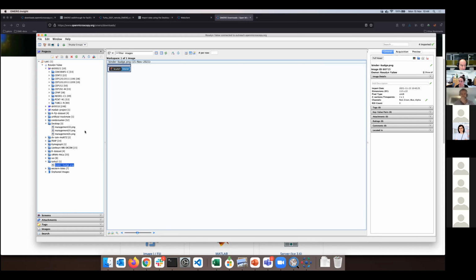So this training server is available for you to further play and explore for 14 days after today. But after that, the passwords will stop working. So don't import anything really valuable.